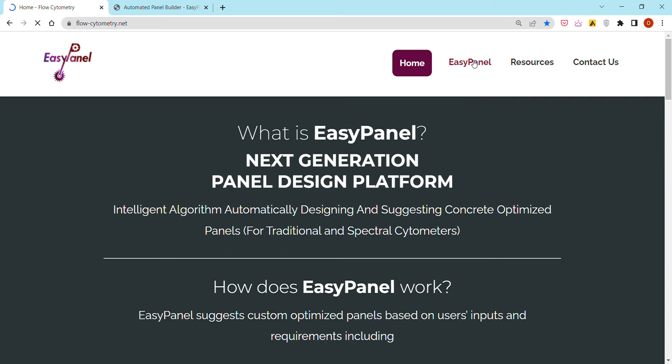The most important and main tab here is EasyPanel, and I'm going to explain today how to design a spectral flow cytometry panel on the Aurora 5 laser in the space of a few seconds.